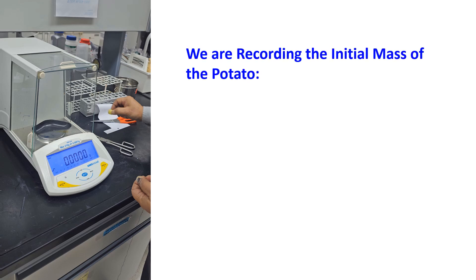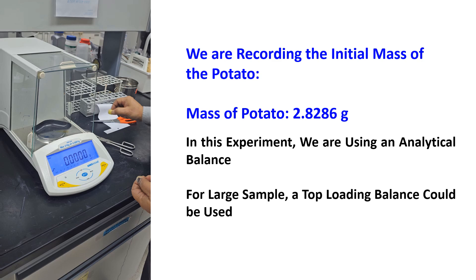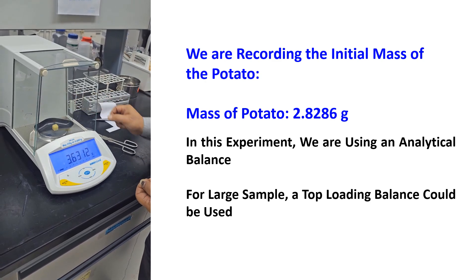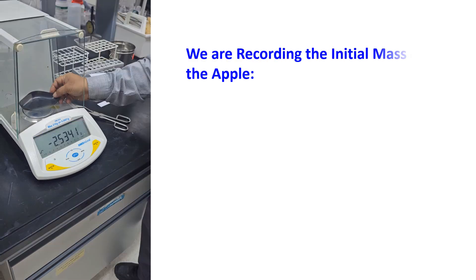We are recording the initial mass of the potato. Mass of potato in air is 2.8286 grams. In this experiment we are using an analytical balance. For large samples, a top-loading balance could be used. We are recording the initial mass of the apple. Mass of apple in air is 2.1402 grams.